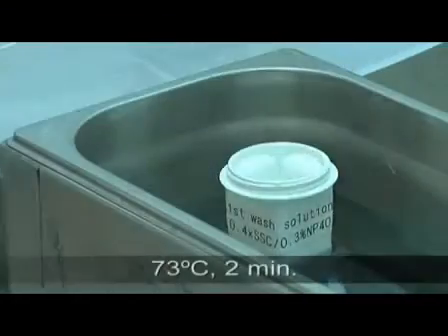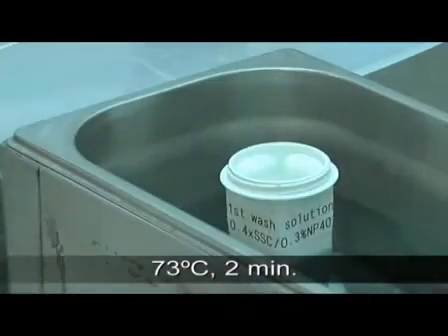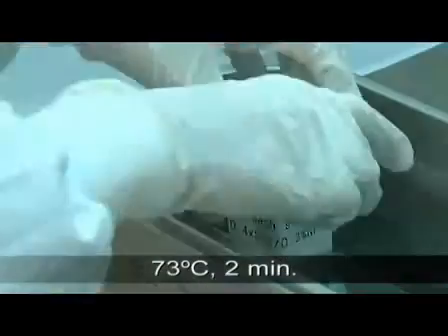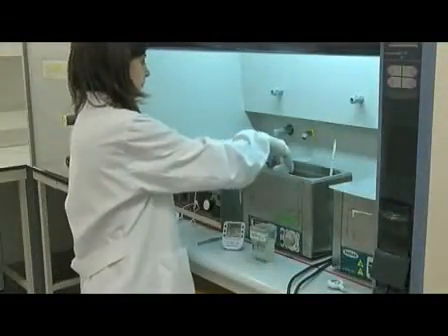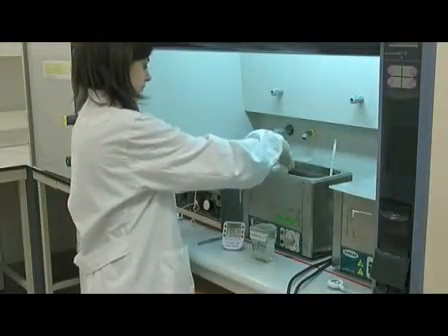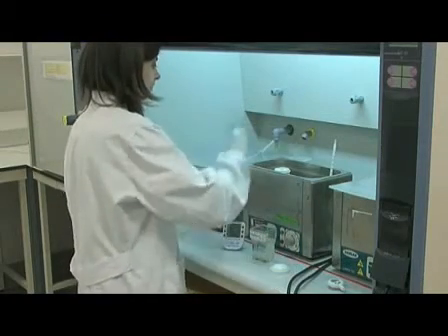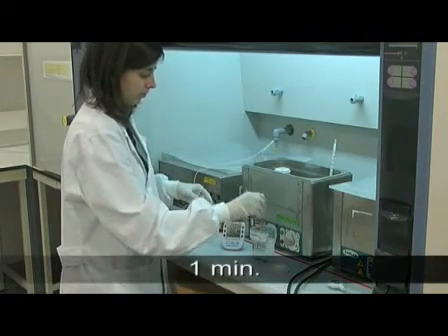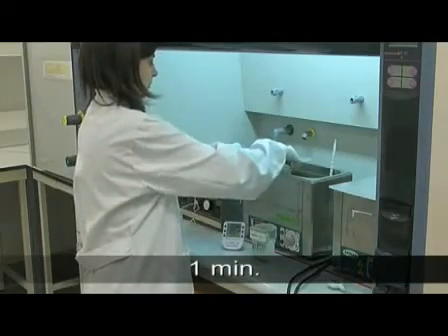The slides are submerged for two minutes in the first wash solution, pre-warmed to 73 degrees C. Then, they are transferred to the second wash solution at room temperature for a further minute. These two washes will help us eliminate any unspecific hybridization signals.